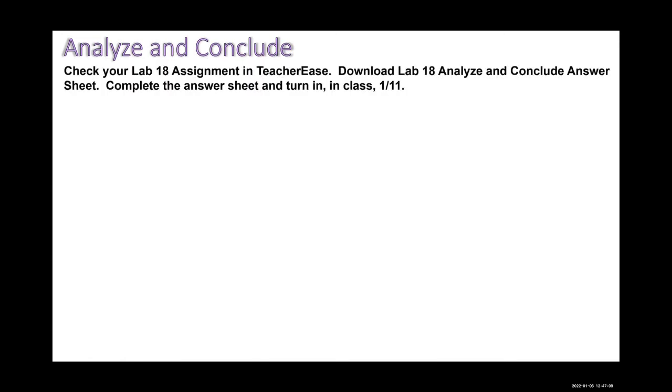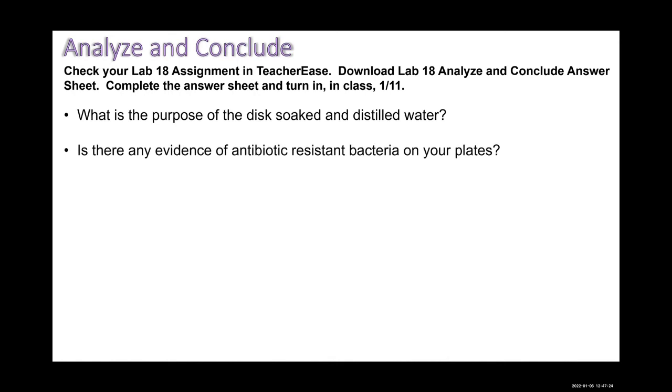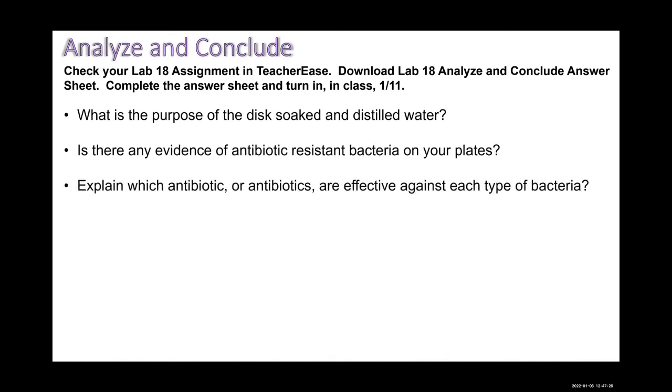Analyze and conclude. You're going to check your Lab 18 assignment in Teacherease, and you're going to download and print the Lab 18 Analyze and Conclude answer sheet. Complete the answer sheet and turn it in class on 1/11. So what's the purpose of the disc soaked in distilled water? Is there any evidence of antibiotic-resistant bacteria on your plates? Explain which antibiotic or antibiotics are effective against each type of bacteria.